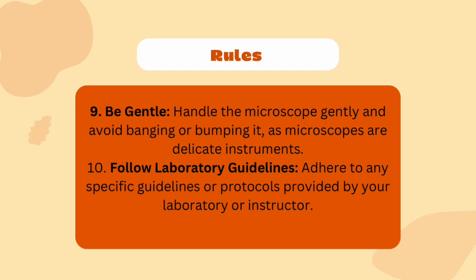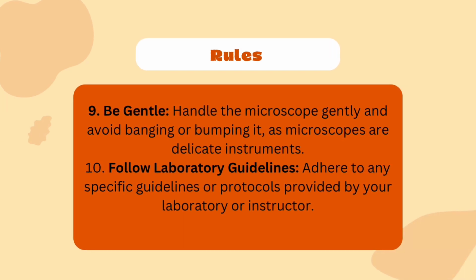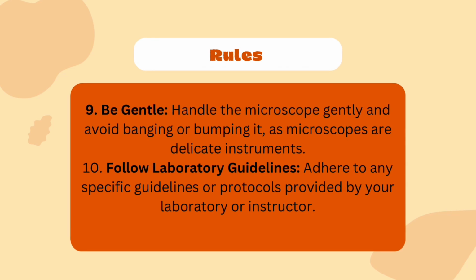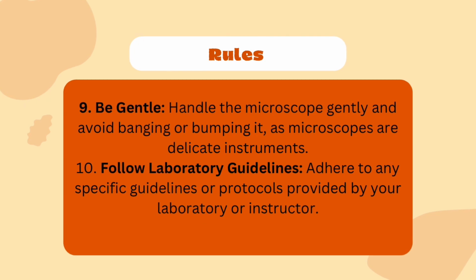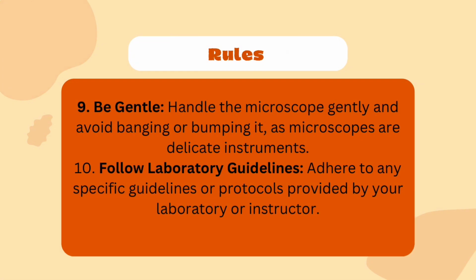And the last two are be gentle. Handle the microscope gently and avoid banging or bumping it, as microscopes are delicate instruments. Last, follow laboratory guidelines. Adhere to any specific guidelines or protocols provided by your laboratory teacher or instructor.